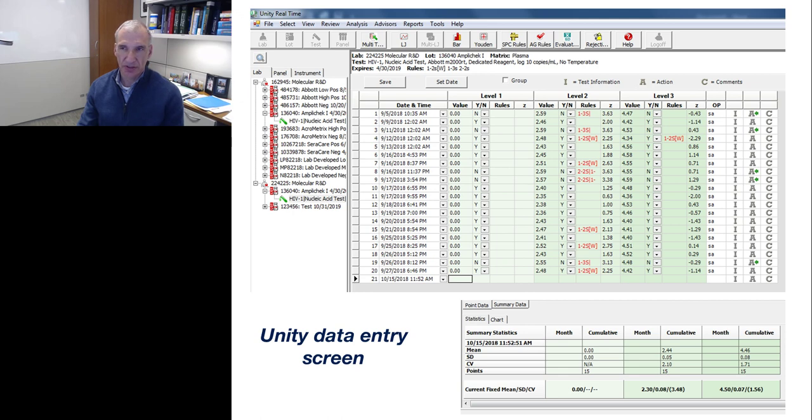We put the standard deviation range too narrow, and so a lot of the values came out outside of those ranges. When we went back and corrected it, the data looks much better, but I kept it here for illustrative purposes, and you can see how those flags are generated. The box at the bottom shows you what the inputted means and standard deviations were.